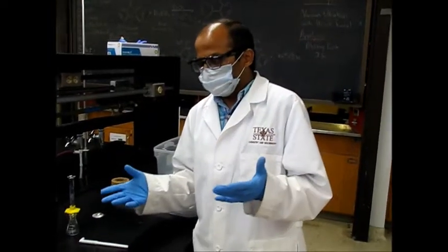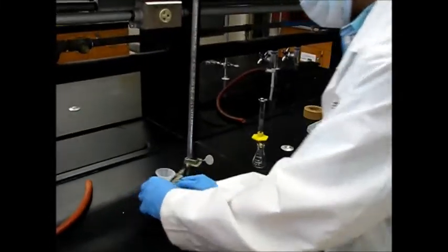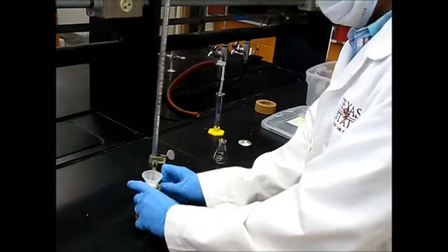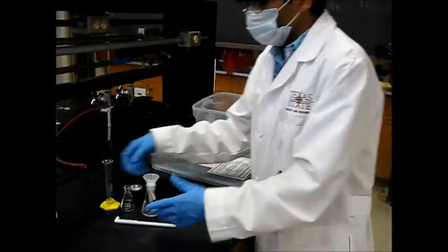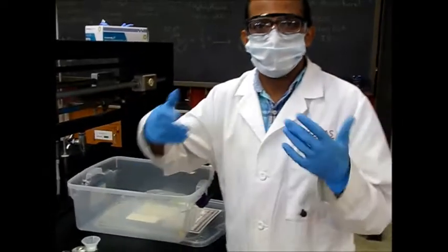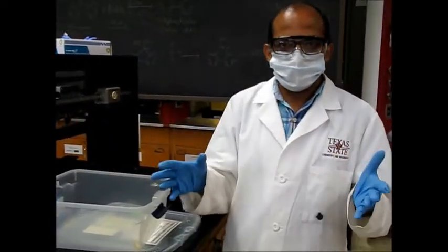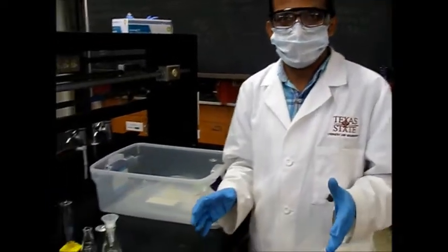So while our compound is drying, now it's time to remove all the dirty glassware. This is another fun part of this lab: to clean all this glassware nicely and dry it, and then return it to the stock room so that it will be available for the next student. And while you are in the lab, don't remove any of your PPE. Please wear it all the time.